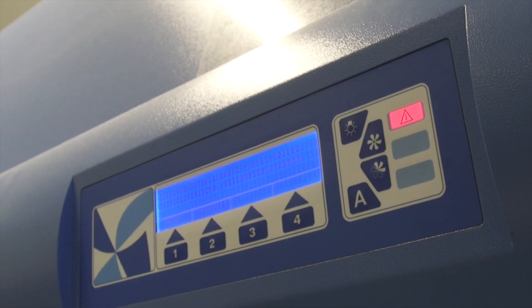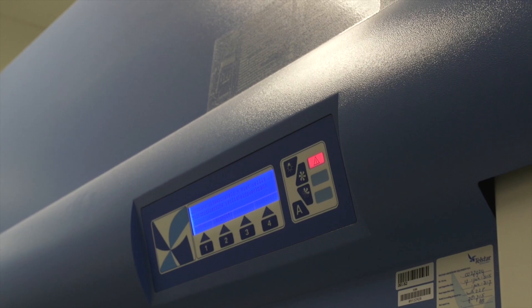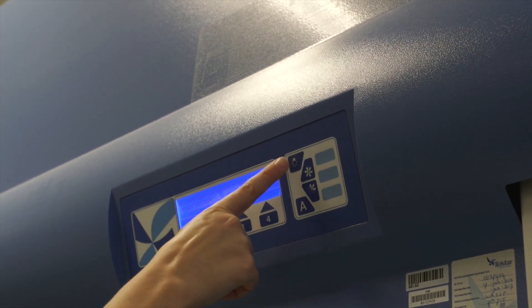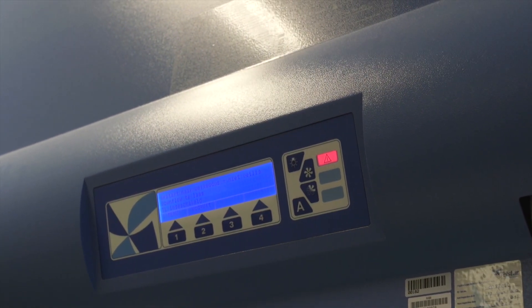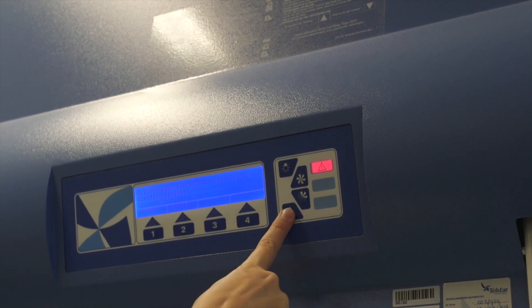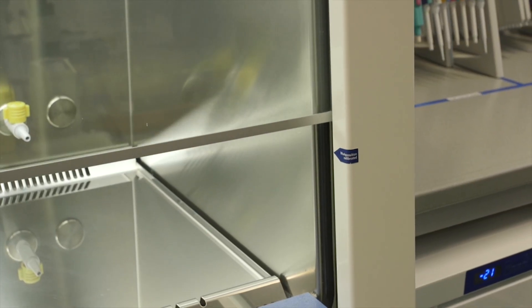The cells are grown under sterile conditions. For this, we use a biological safety cabinet, also called a flow cabinet. Turn on the flow cabinet with this button and the lamp with this button. You will hear an alarm because the airflow is not yet ready. Turn off the alarm with this button. Make sure the screen is adjusted to the correct height.